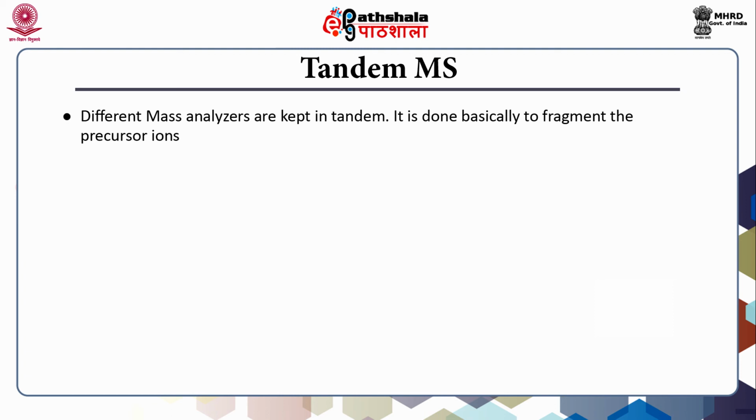The mass which comes out in the first instance can be called a precursor, and subsequently these precursor ions are broken down in subsequent mass analyzers which give daughter ions. So, in a mass spec principle, you can get the intact mass, and subsequently that molecule has to be broken down again to give daughter ions, which give smaller masses, but they have been derived from the precursor's mass.